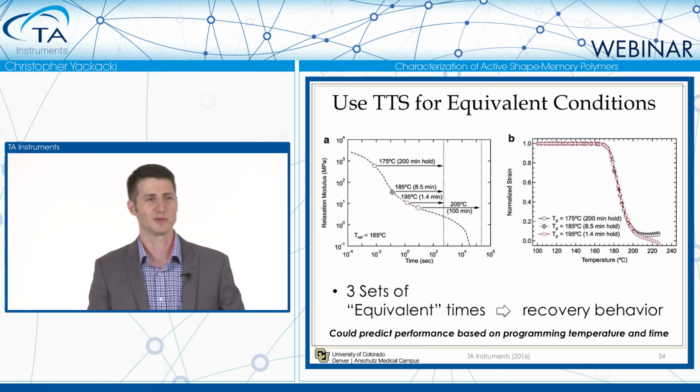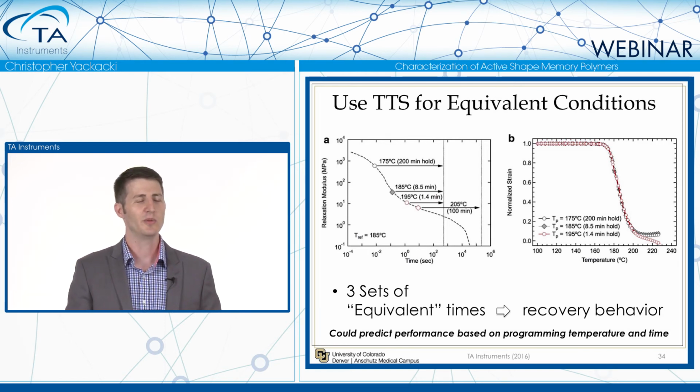The same thing really works for polymers with time temperature superposition. So what we did here is we took the master curve for the relaxation modulus, and we have some starting points.